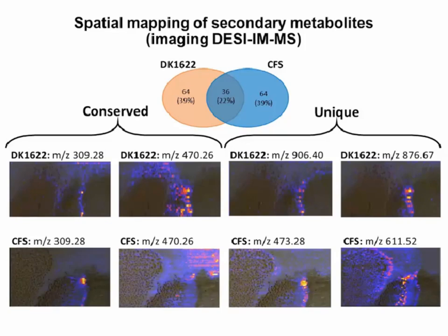This number is significantly higher than the 3% conserved within all of the features of each experiment, not just in the predation region. Here we highlight unknown features that are both conserved and unique within each experiment. Each has heat maps that are of particular interest within the predation region itself.